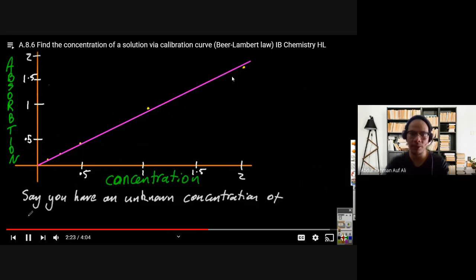So kalau kita nak measure any concentration ataupun calibration curve, kita panggil dekat dalam analysis, in analysis method of analysis, kalau kita ambil lah any solution, kamu kalau kamu buat air teh dekat rumah, kalau kita nak measure the calibration curve, the concentration of the solution, kita prepare in different concentration of tea, masukkannya dalam spectrophotometer, the graph should look like this, a straight line, a linear graph, naik ke atas.